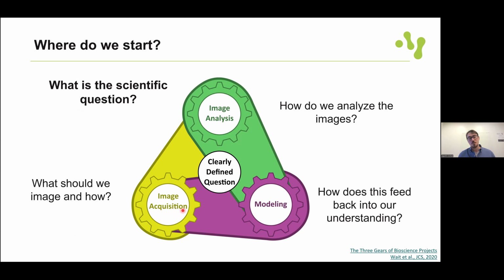Because if you try to attempt a perfect image acquisition and you generate a huge data set, when you jump to image analysis, you might notice, oh, I did not think about this specific thing. And then you generated a whole data set that is almost unusable.